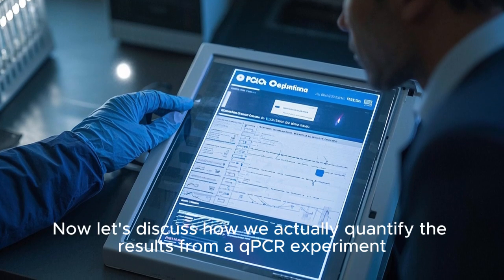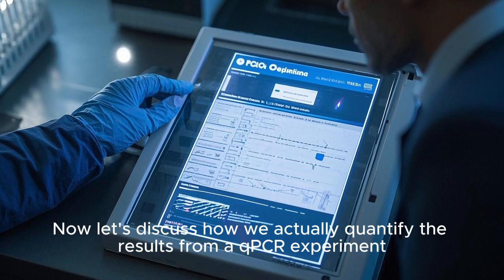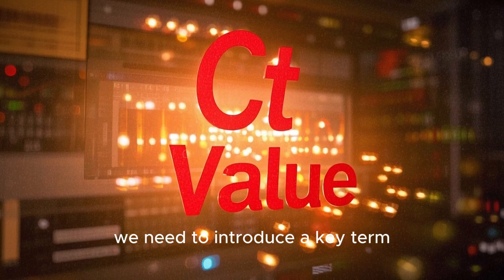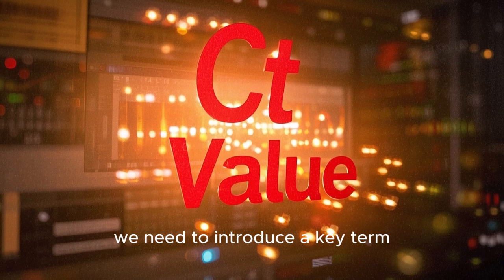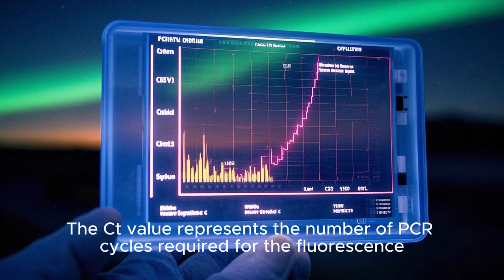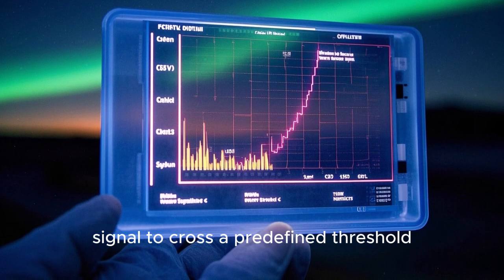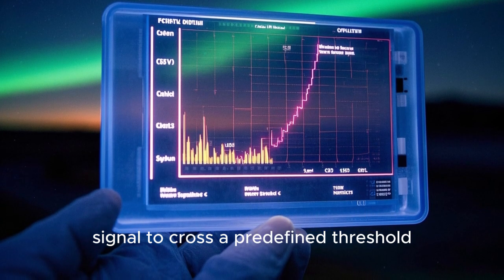Now let's discuss how we actually quantify the results from a qPCR experiment. To understand this, we need to introduce a key term: the threshold cycle, or CT value. The CT value represents the number of PCR cycles required for the fluorescence signal to cross a predefined threshold.